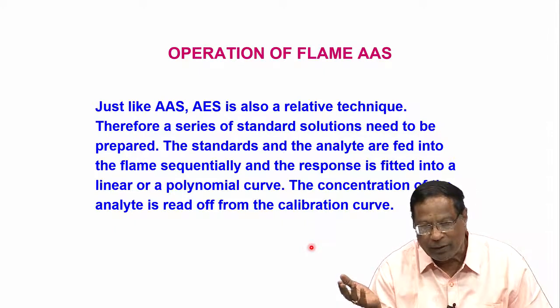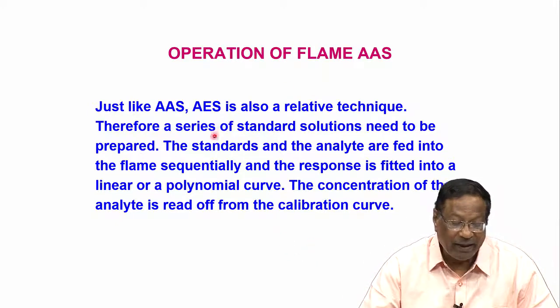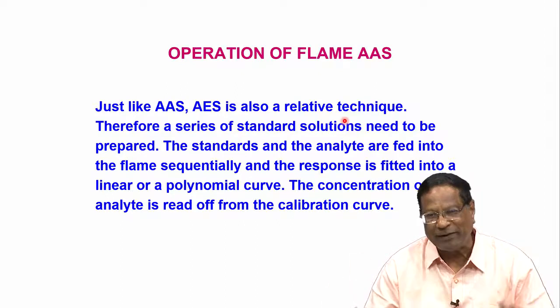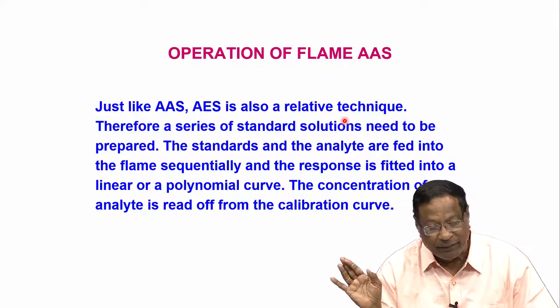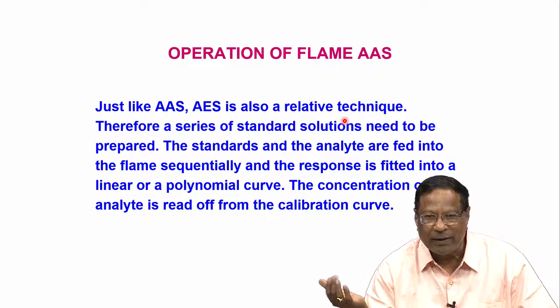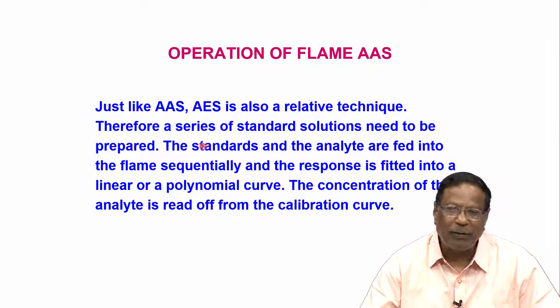If you are using atomic absorption, you just have to change the switch and start the operation. Just like AAS, it is also a relative technique. That means the analysis is as good as your standards. If your standards are no good, your analysis is no good. So, depending upon what signal your standard gives, the unknown signal is compared to that of the standard, which is just like what we have discussed earlier.